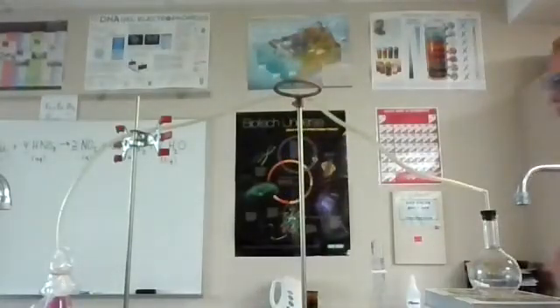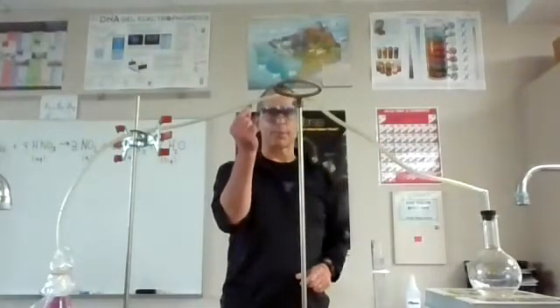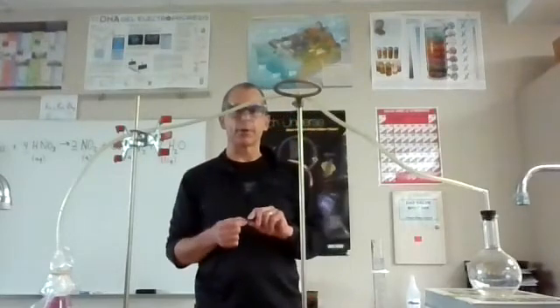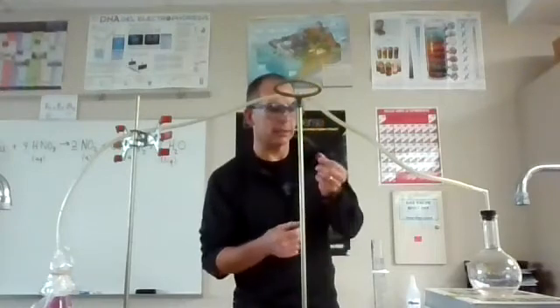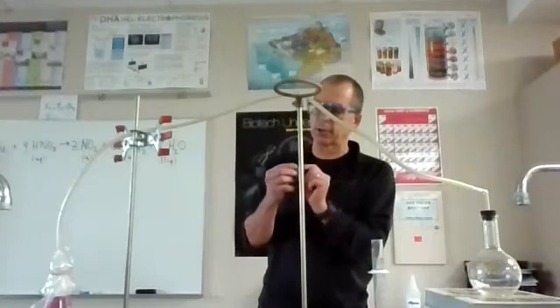Hi, we are going to do an experiment here, and I have a copper penny. This is from before 1982, pure copper, and this is like number 9 in your homework packet. It's kind of a demo to go with this. I think I did it in one of the other worksheets.